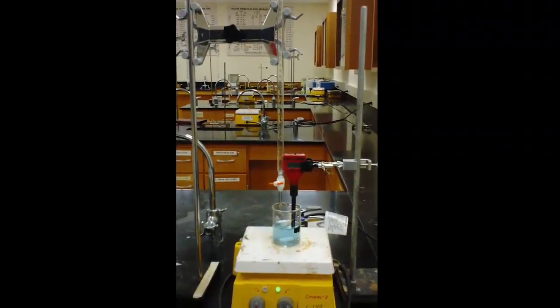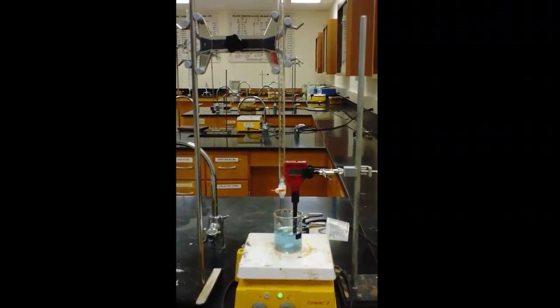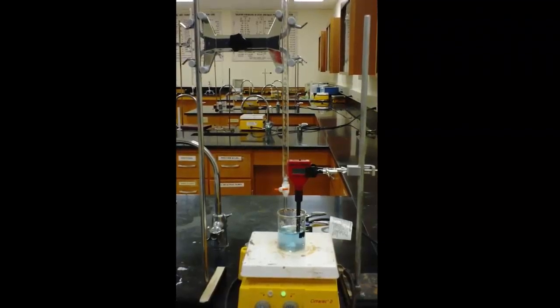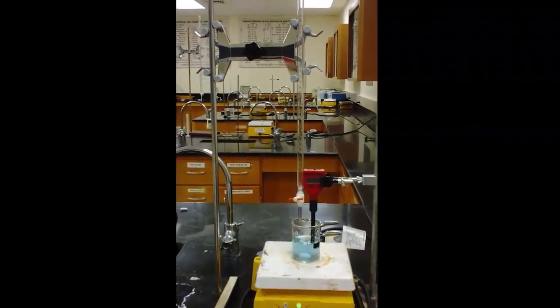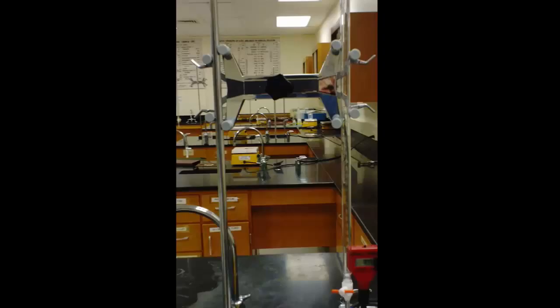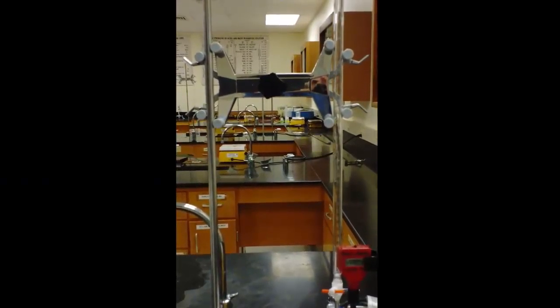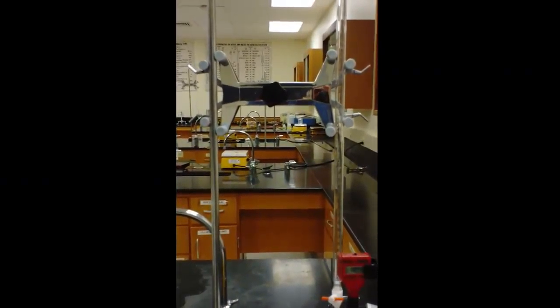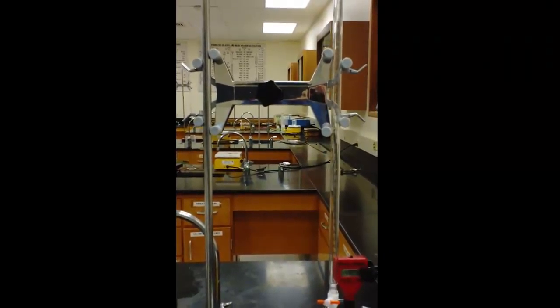For the titration lab, you're going to want your equipment set up like this. If you look at the ringstand that's holding the burette, you will see that the burette clamp is clamped not with the center pole portion, but one side is clamped to the ringstand, the other side is clamped to the burette.